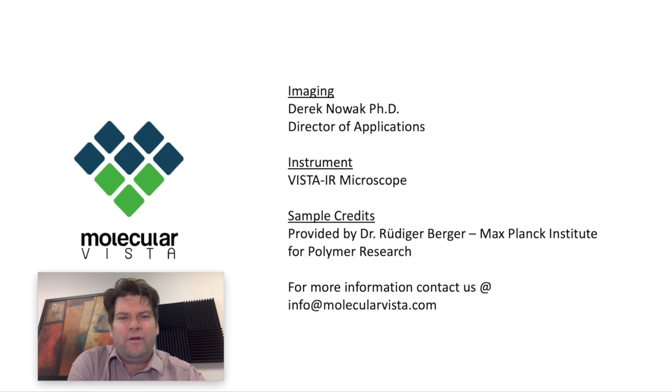Okay, well I hope you enjoyed this short video where we took PLA and ACM nanocomposite and deconvolved it spatially and spectrally using the PiFM technique. I think it really shows the power of the PiFM technique to be able to go into 10 to 20 nanometer areas and get a good FTIR-like spectra that you can use to investigate these unknown materials and known materials and their composites.